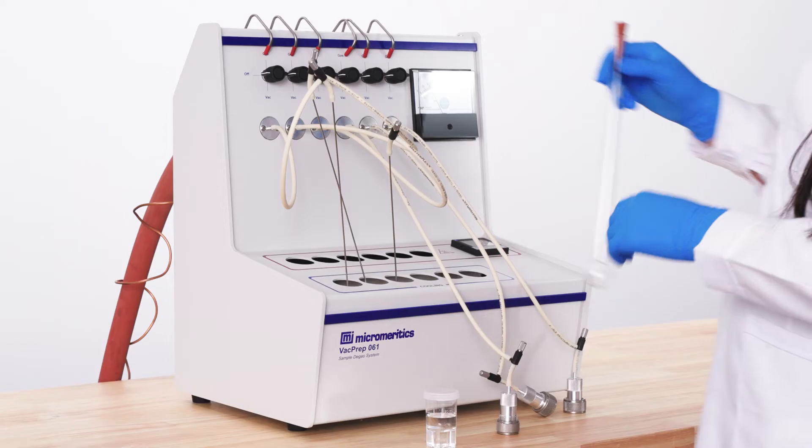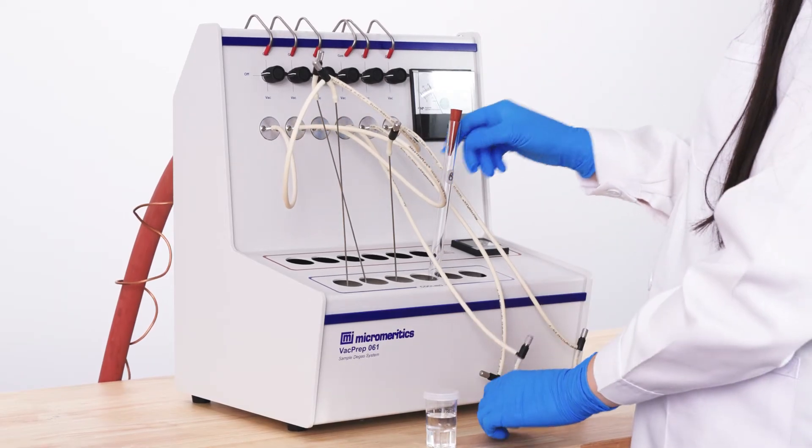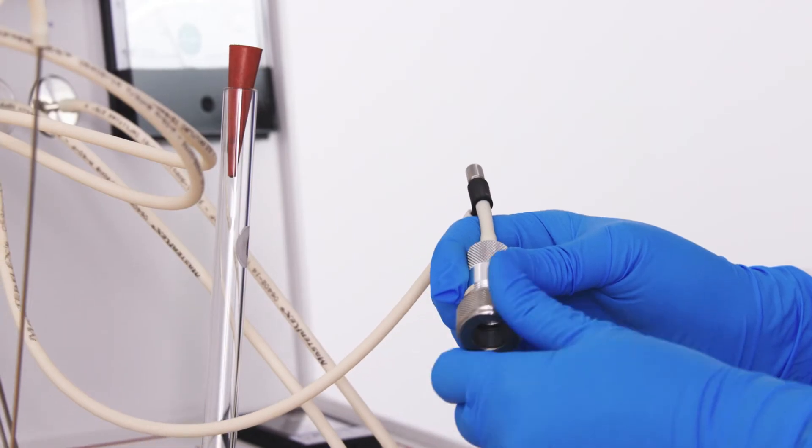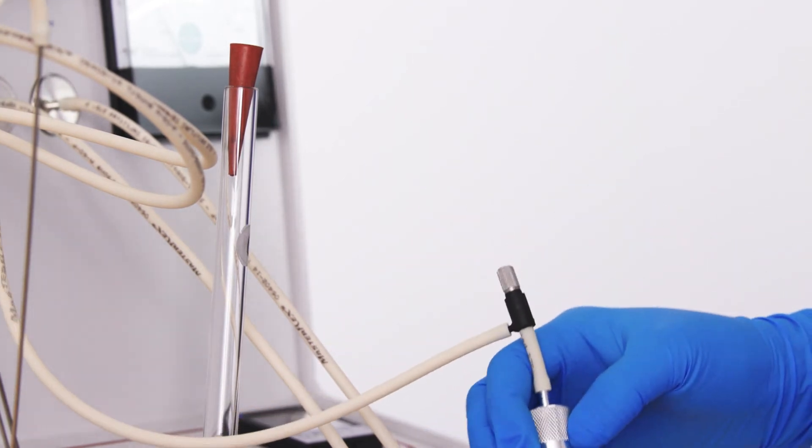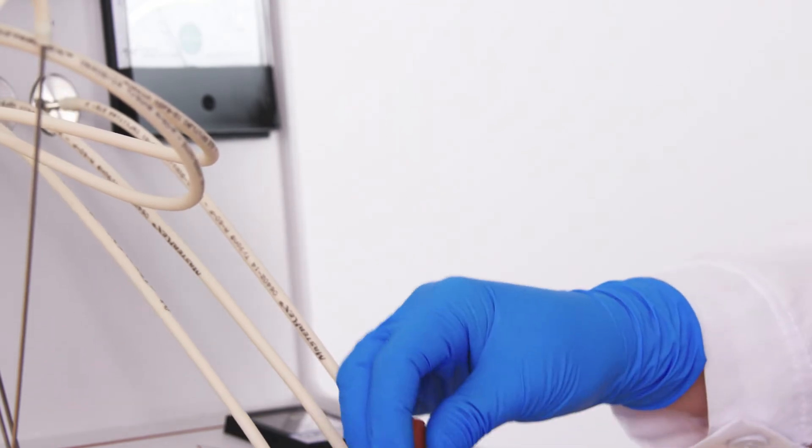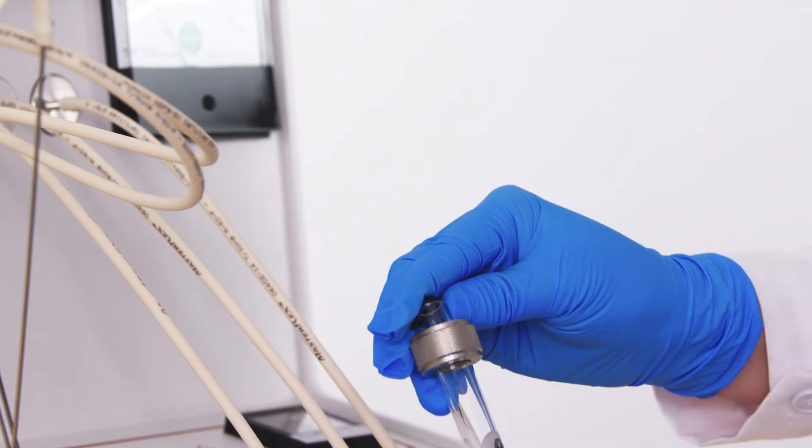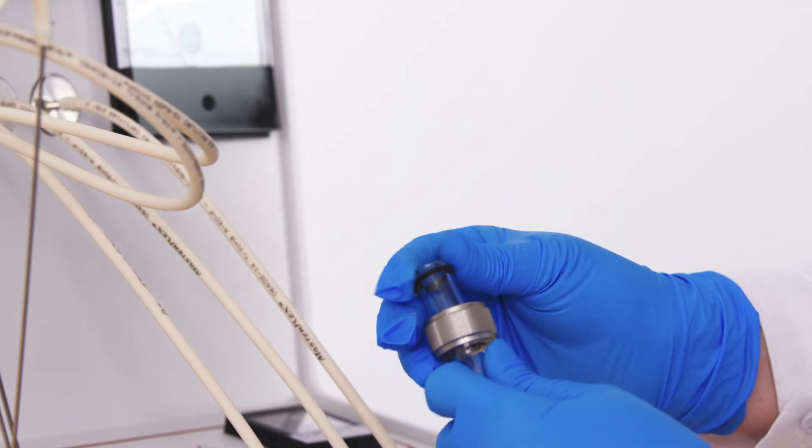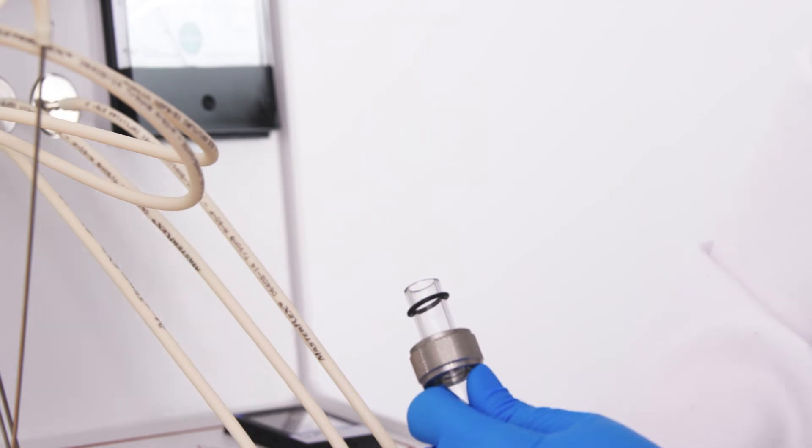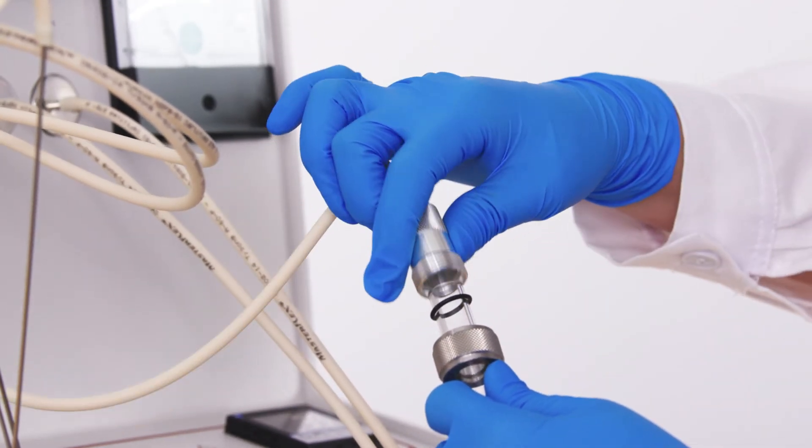To begin, place the sample tube into the cooling station. Unscrew the nut, ferrule, and o-ring from the sample tube mount. Then place the nut assembly onto the sample tube as shown and screw into the sample tube mount.